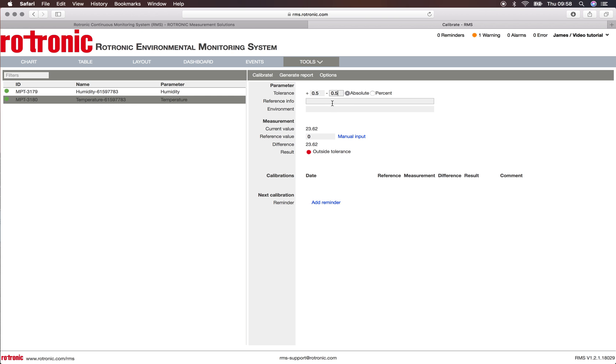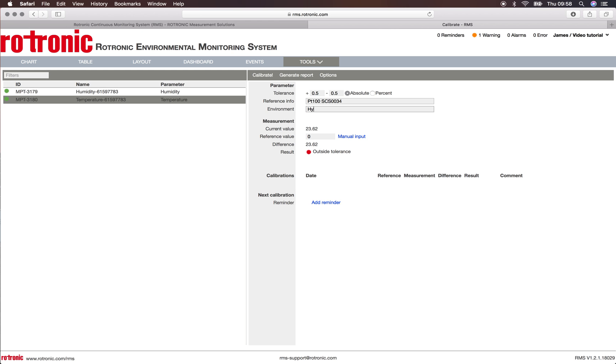We then add a reference. The reference is a PT100 with an SCS calibration. This SCS calibration is the number 0034, and we can specify the environment. The environment that generates the temperature is the Hygrogen, the electronic portable relative humidity and temperature generator.